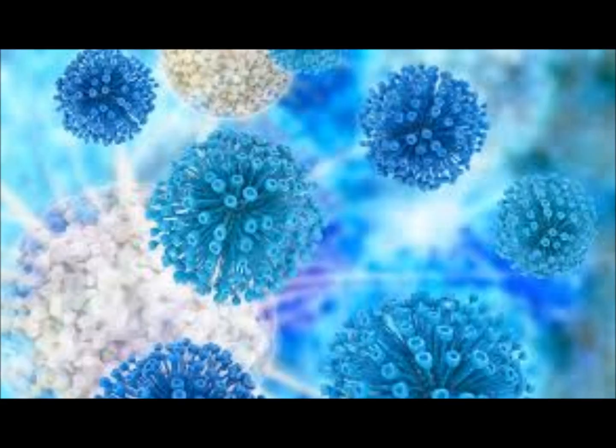So this is ahead of the game. I'm not going to make you know it for your test 1, but it won't hurt you to hear, because by the end, you've got to know you plate a urine differently on the blood plate. And depending on the loop you use putting that urine, you have to count your colonies and multiply it.